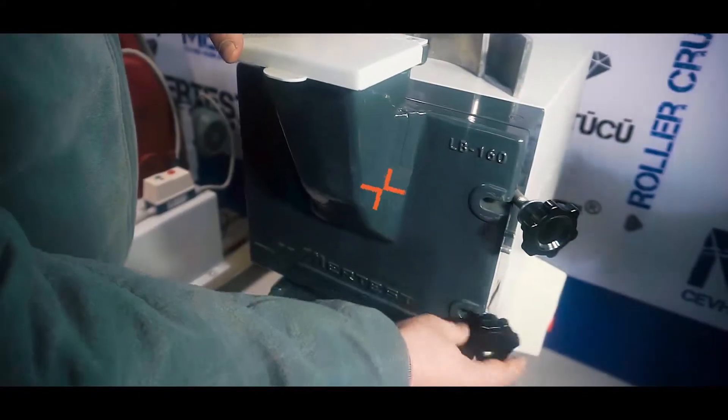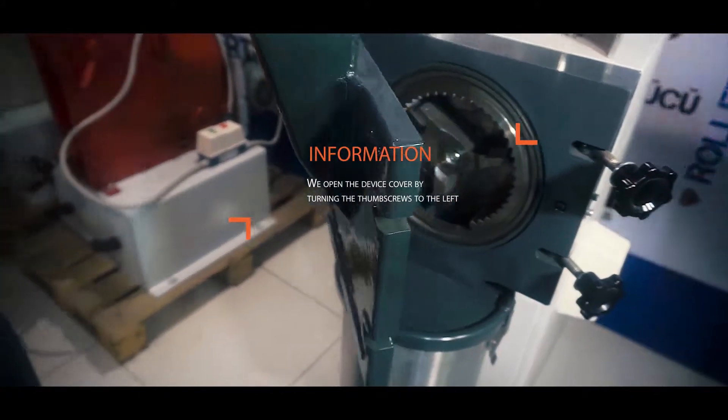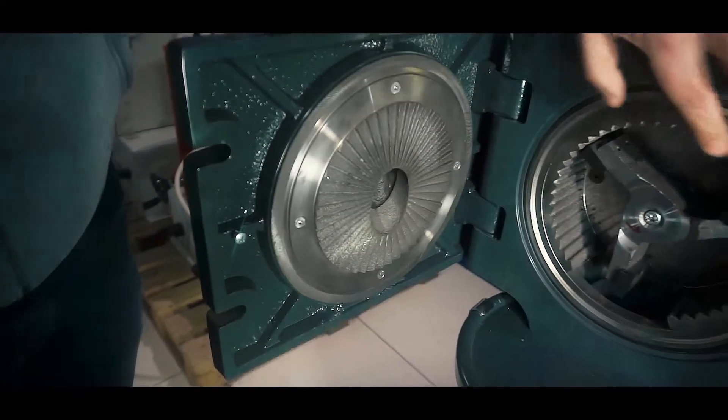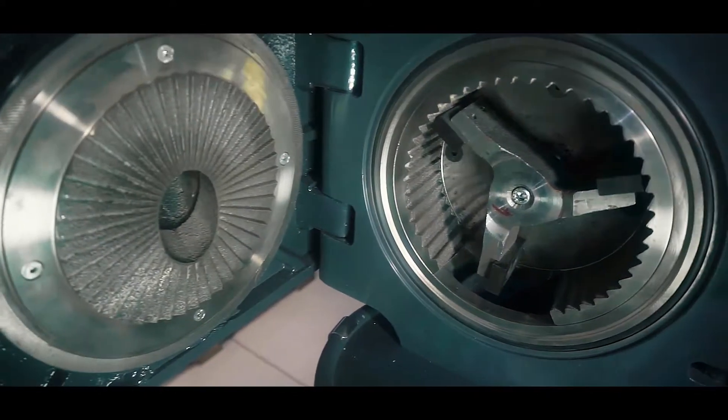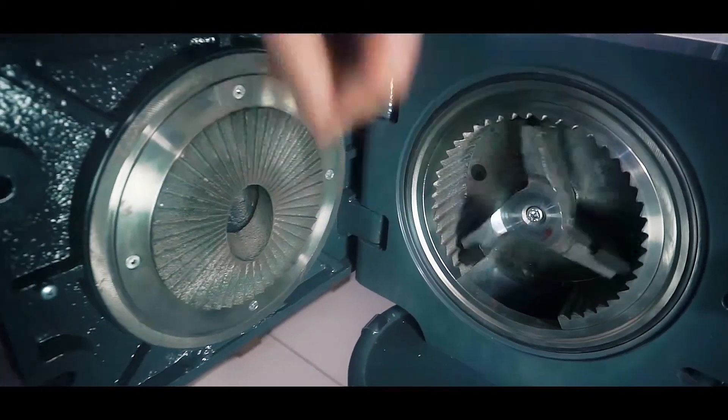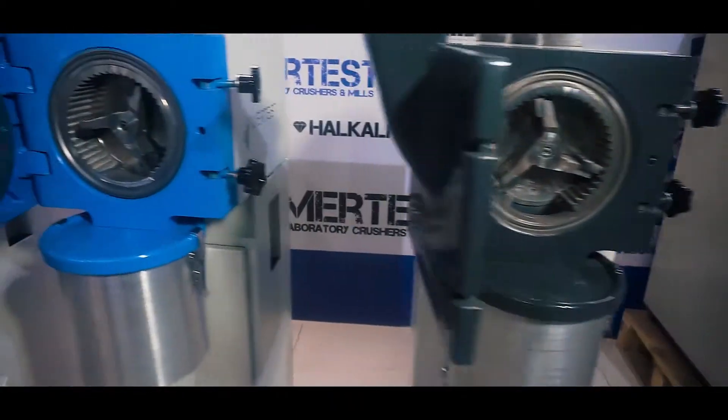We open the device cover by turning the thumb screws to the left. Lining plates and grinding elements inside the grinding chamber of the machine are made of special alloy steel casting. In this way, the wear is minimized when hard material is ground.